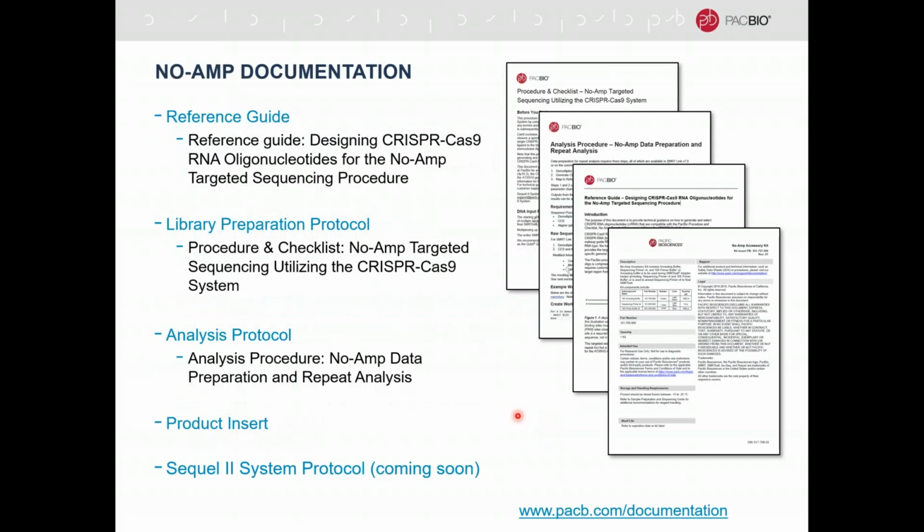We have this fully supported protocol from a reference guide on how to design a new guide, and we typically recommend third parties. We found them to be the most robust for designing new guides. For PacBio specific library prep or sample prep protocols, we have a procedure and checklist. All the analysis tools that Jenny has nicely described to you. There is an overview document, an analysis protocol document, which walks you through what is done within SmartLink, which is our GUI-based tool, all the way through to some command line tools that are very easy to use to be able to visualize some of these results.